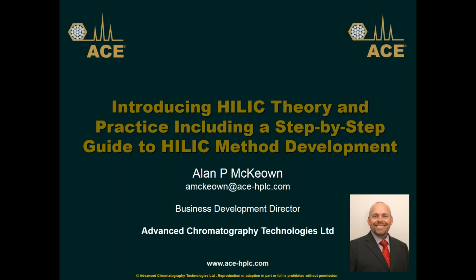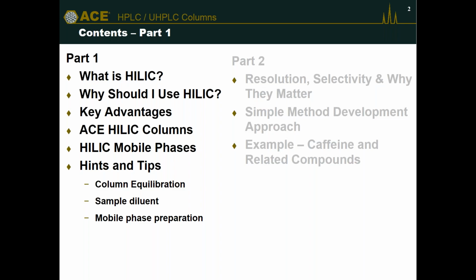So this presentation is split into two parts. First of all, I review some of the basics. So first of all, what is HILIC as a technique and when should you consider it? As separation scientists, we're challenged with problems every day, separating different analytes in different matrices. How do we know when we should consider HILIC as a technique, when maybe reverse phase or ion exchange or even GC and other types of techniques may not be appropriate? So I'm going to cover some of those points today.